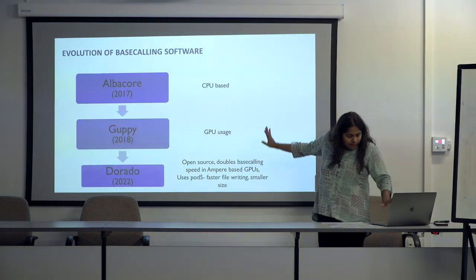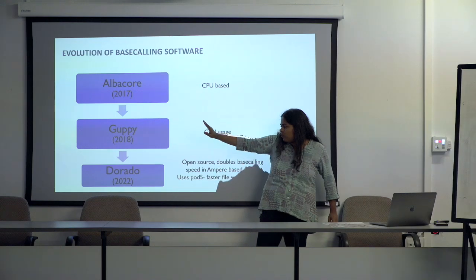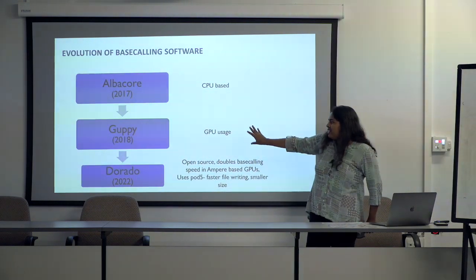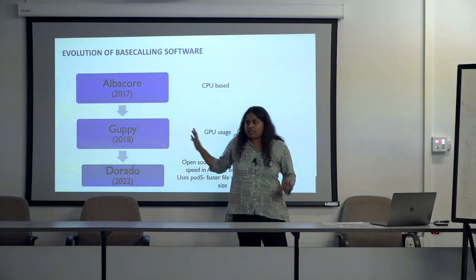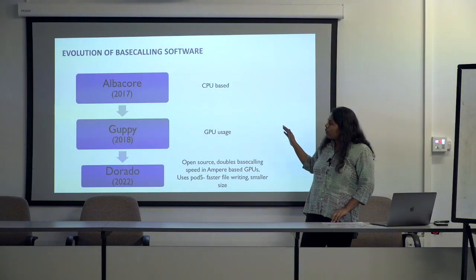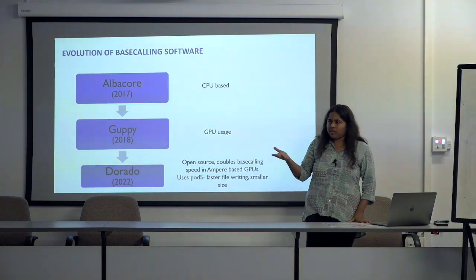Yesterday I used Guppy, because I think it would have taken time to convert files for Dorado, and I wasn't very sure whether the latest upgrades would work. Guppy is still quite standard. When you are setting it up in MinKNOW itself, you can set up the base calling like you saw yesterday.